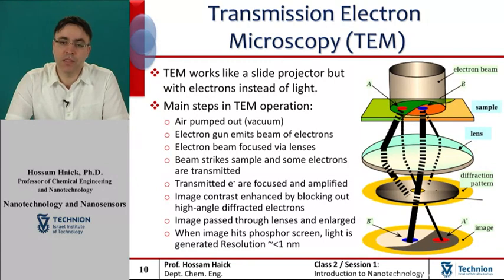Resolution of the TEM is limited primarily by spherical aberration, but the new generation of aberration correctors has been able to partially overcome spherical aberration to increase resolution. Hardware correction of spherical aberration for high-resolution transmission electron microscopy, usually abbreviated HRTEM, has allowed the production of images with resolution below 0.5 angstroms or 50 picometers and magnifications above 50 million times.